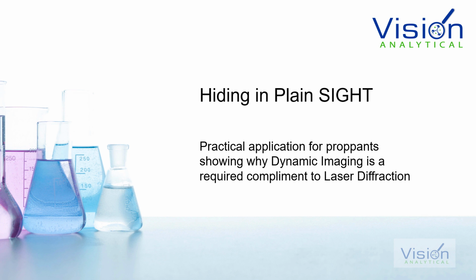Hello everyone. Today we're going to be going over a new case study. Today's case study will be an application in the oil and gas industry that can also be used in many other industries as well. We're going to be going over why dynamic image analysis is a necessary complementary technique to laser diffraction.